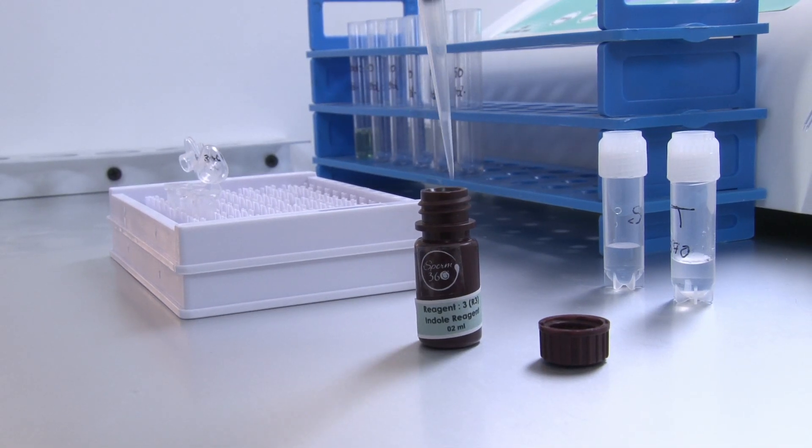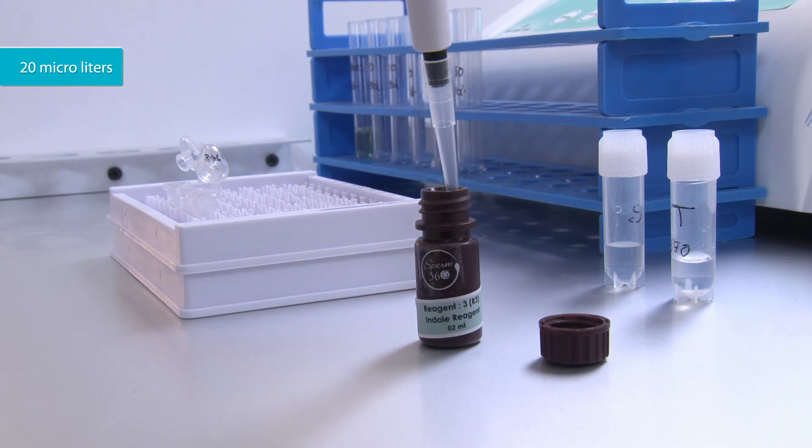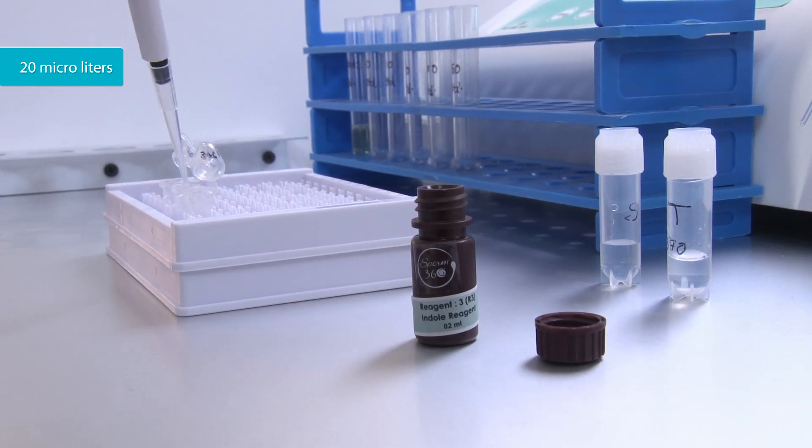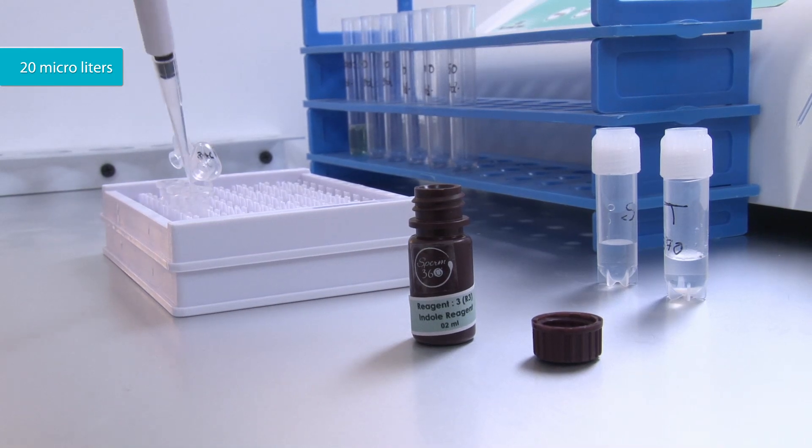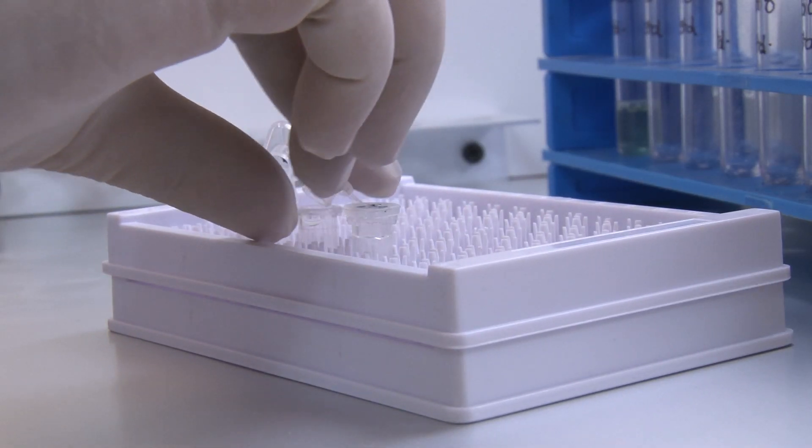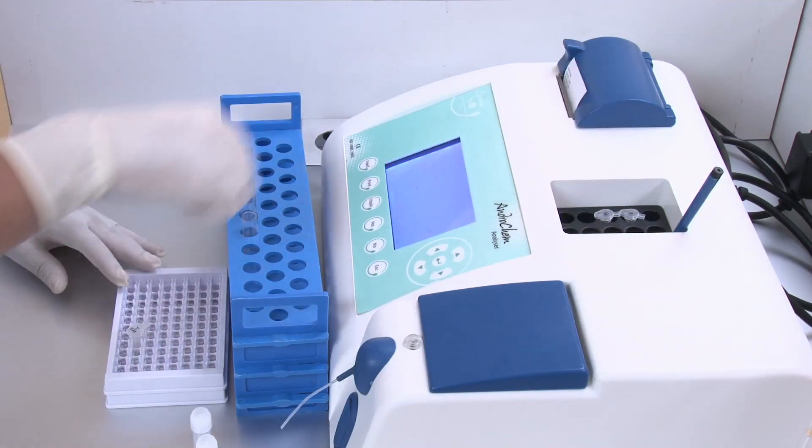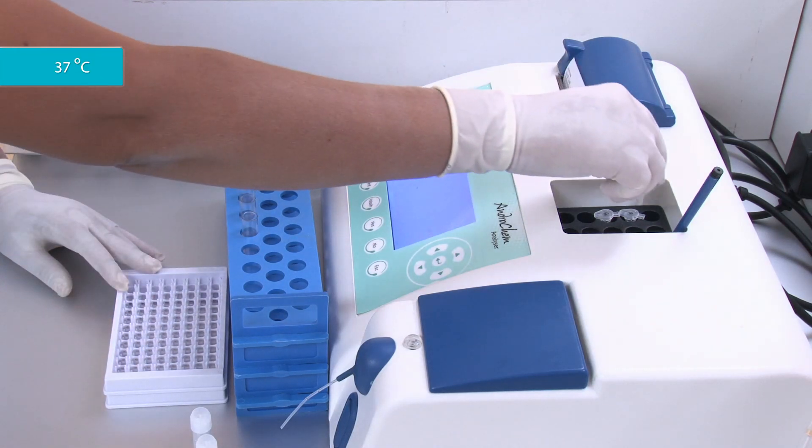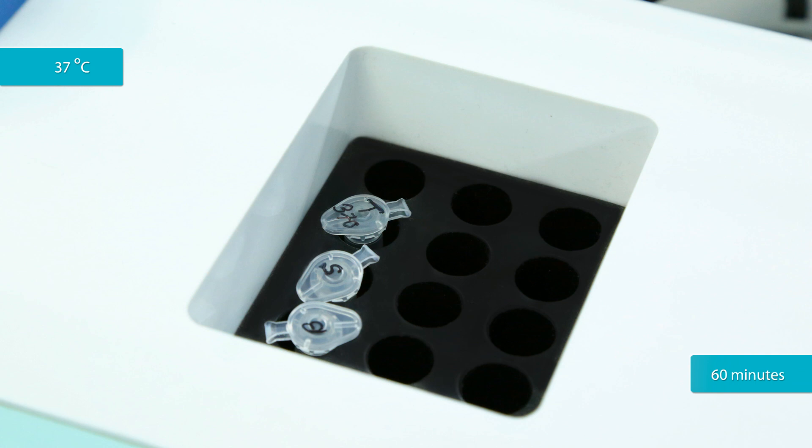Add 20 microliters of Reagent 3 to all the tubes. Seal the tubes. Incubate the tubes at 37 degrees Celsius for 60 minutes.